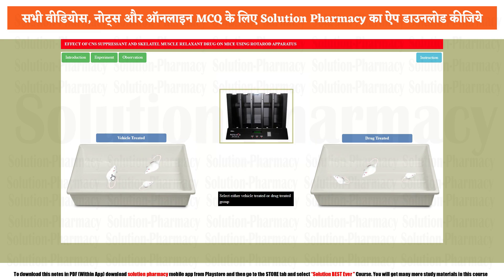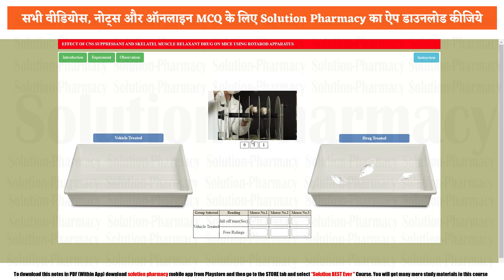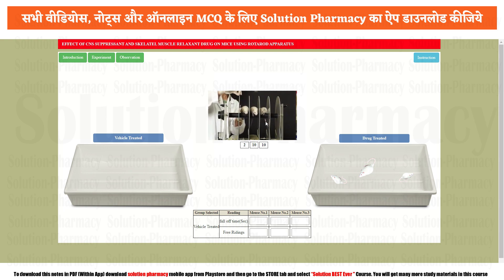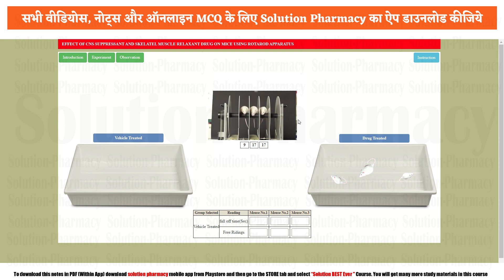So let's start the practical by performing from the vehicle treated group. As we have already seen, this machine has a three-compartment model, so all three mice can be started with one click. If I click on one mouse or rat, all three will be selected automatically. Now you can see the counters starting and the rod rotating. The two or three rats have been placed on the rotating rod — observe their movement and their free riding.